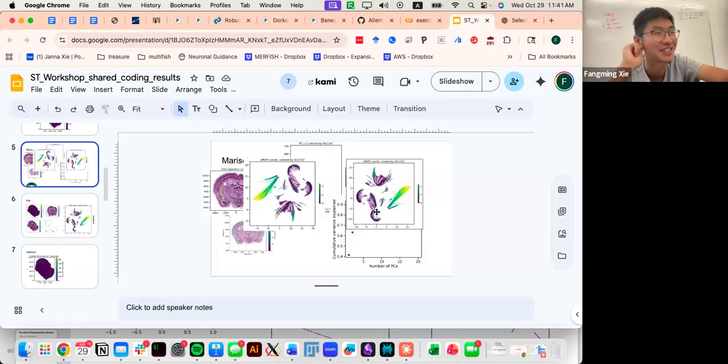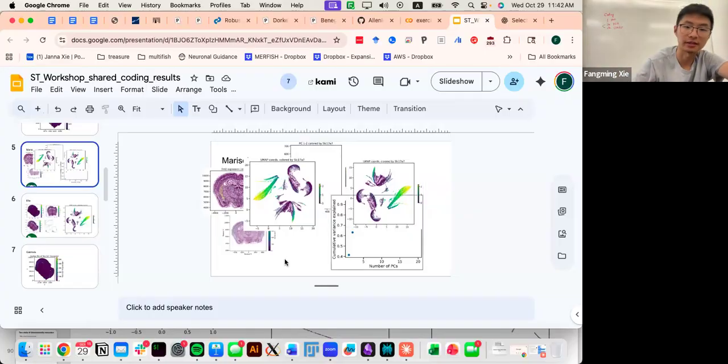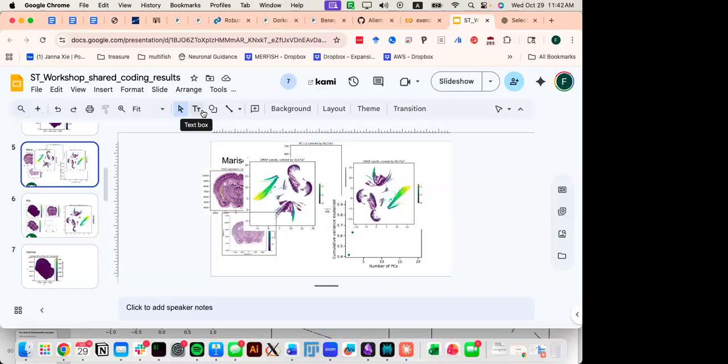Maybe ask AI to do it for reproducibility purposes, but still, the pattern, the specific shape doesn't mean anything. It's just the cluster, like where the individual cells are mapping to. Right, okay. All right. Thank you very much.